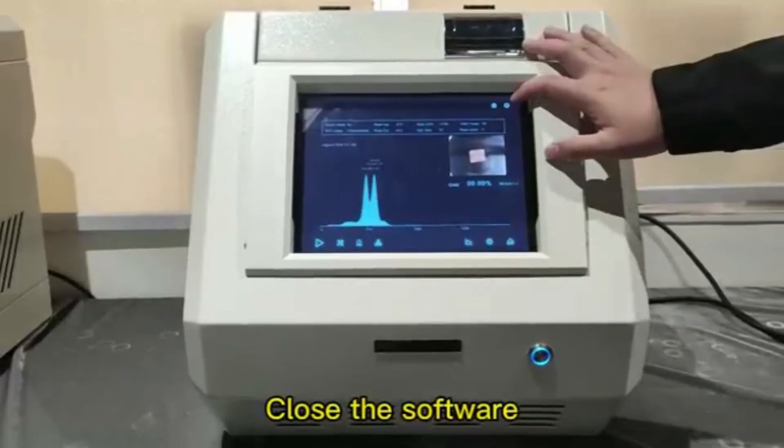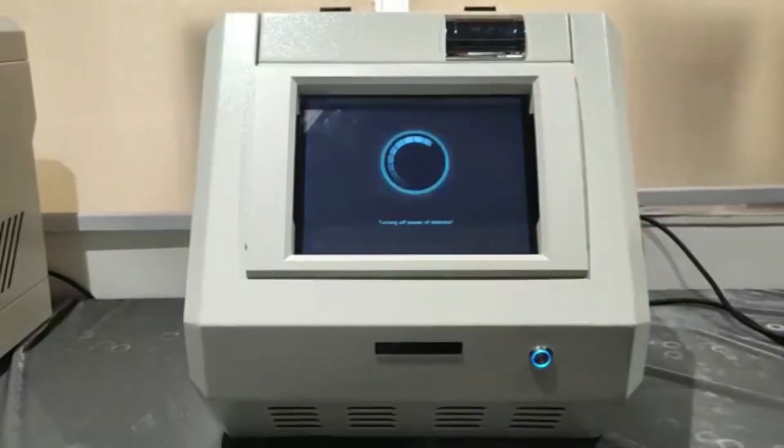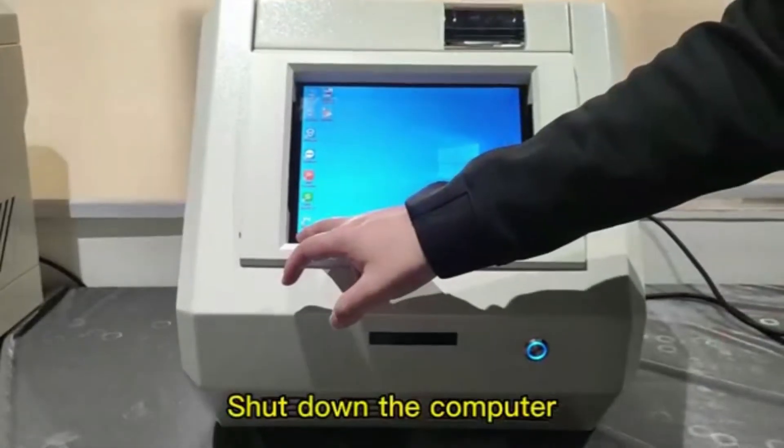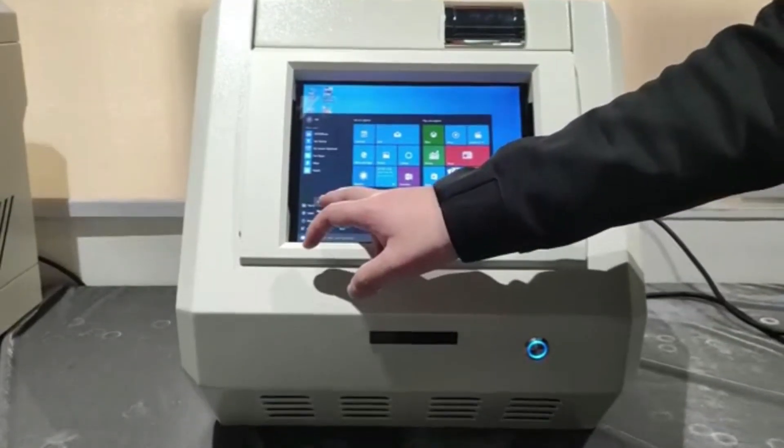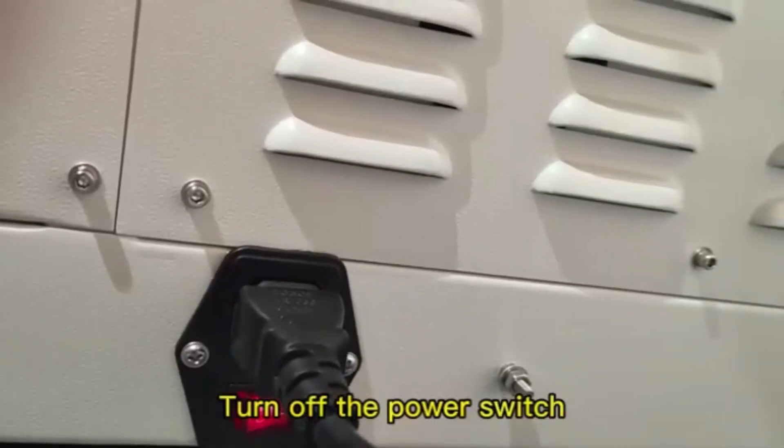Close the software. Shut down the computer. Turn off the power switch.